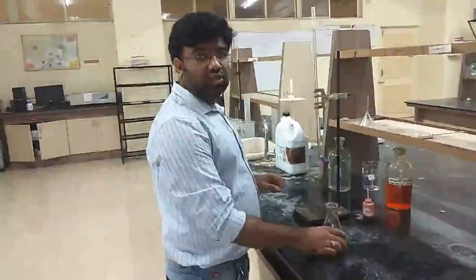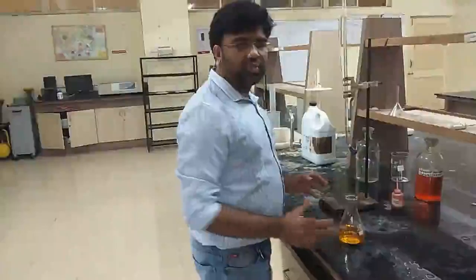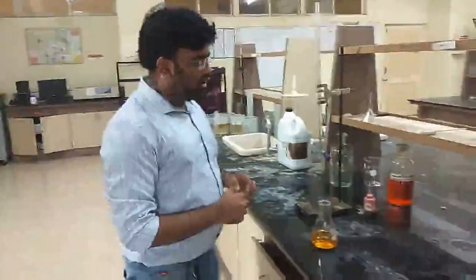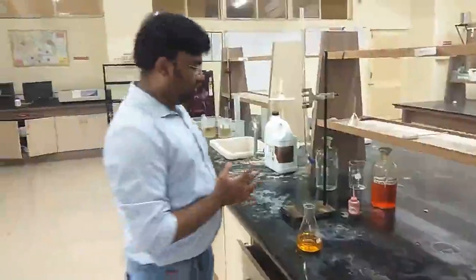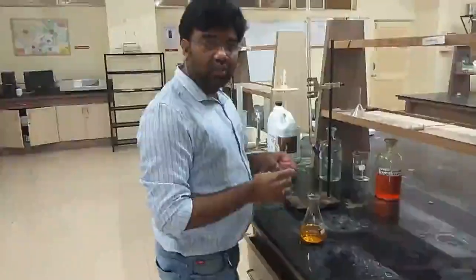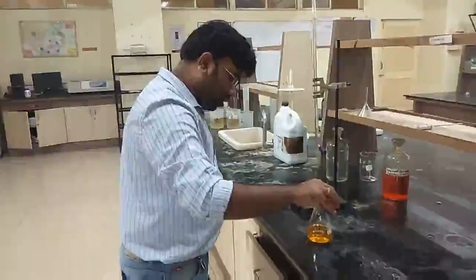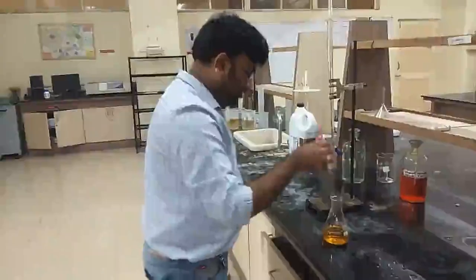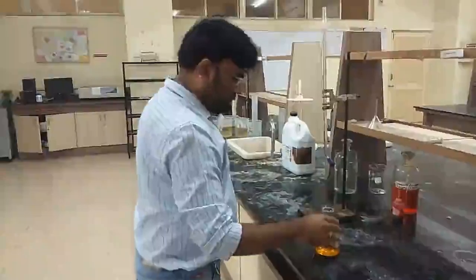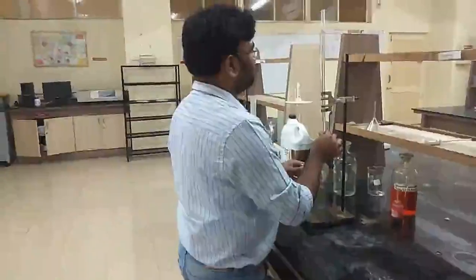We have emptied the COD digestion flask in the conical flask. The next step is just to add the ferroin indicator and to do the titration against FAS, and the endpoint color is the stable brown color. Yes, we have added the 4 drops of ferroin indicator. Now let's start with the titration process.